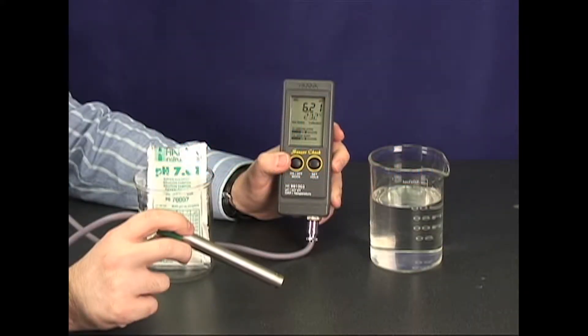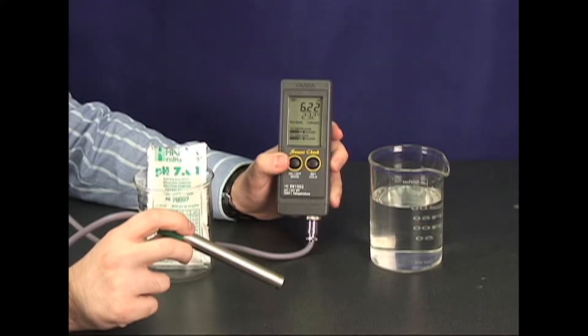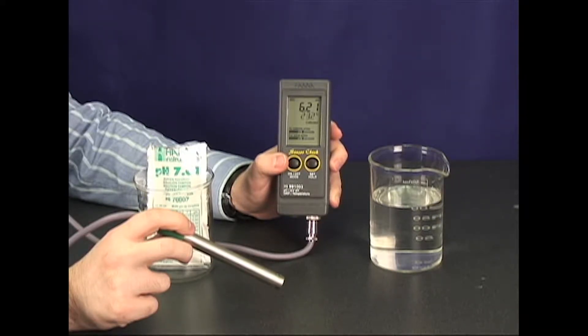The Hanna HI991003N is one of the most accurate and easy to use pH, millivolt, ORP, and temperature meters.